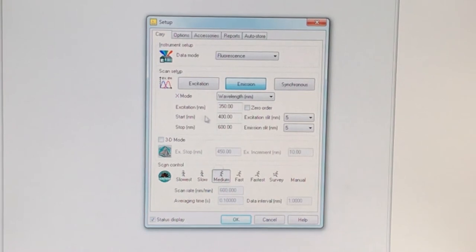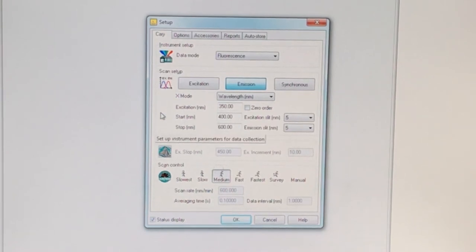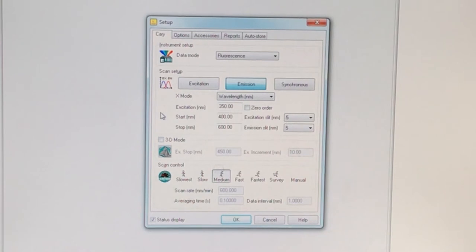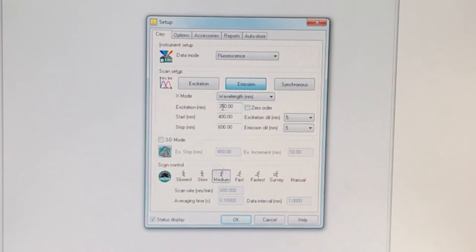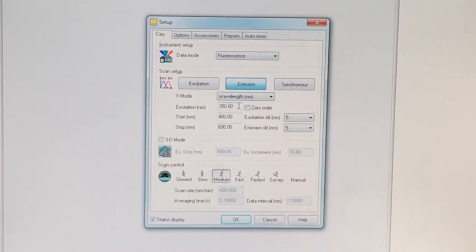And then the start and stop refers to the wavelengths from which we're going to collect the emission. You want to make sure that the start wavelength is at least 10 nanometers greater than the excitation. This helps protect the detector.